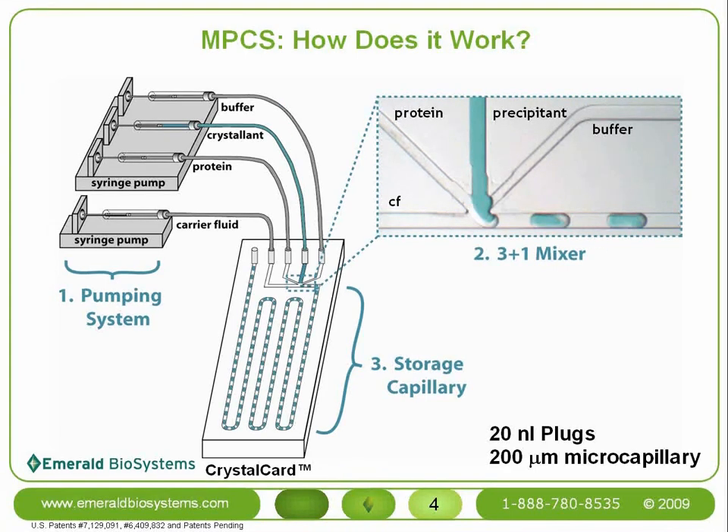Upon starting the flow in a primed crystal card, 20 nL-sized aqueous droplets, which we call plugs, begin to form in the microcapillary. Plug composition is controlled by controlling the flow rates of the fluids entering the crystal card. The plugs continue to form until the third basic component of the MPCS, the storage capillary, is completely filled. Here we see a primed and ready crystal card.